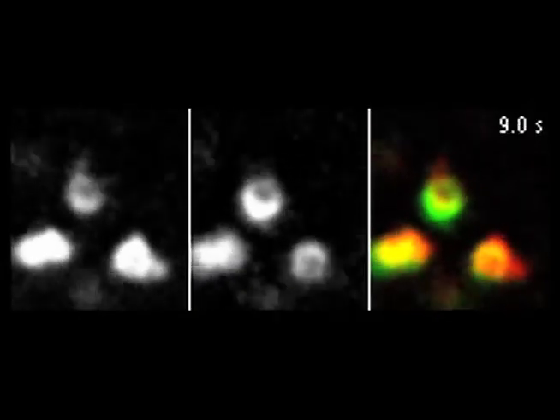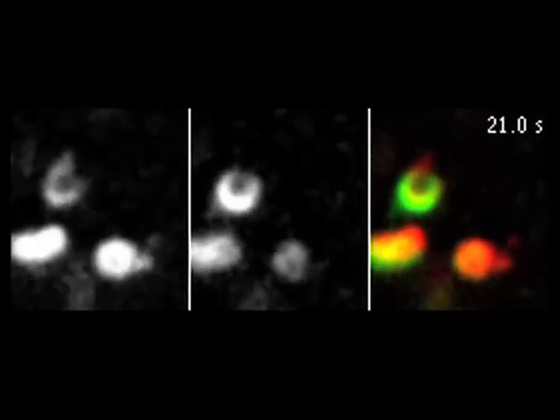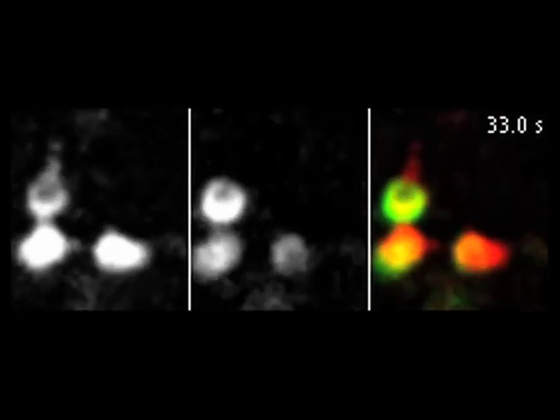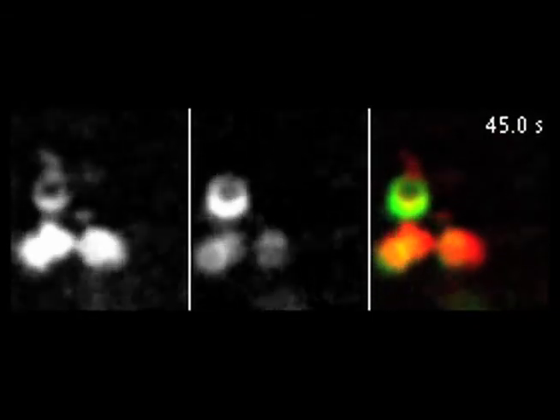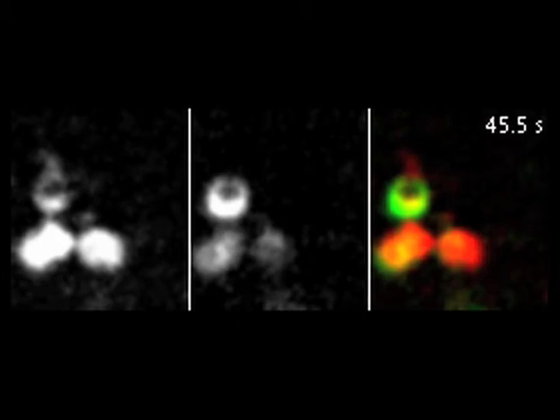Using live cell confocal microscopy, we were able to visualize individual sorting events as they occurred in the endosome. As seen in this example endosome, the recycling beta-2 adrenoreceptor was sorted into endosomal tubules. These tubules are devoid of the non-recycling delta-opioid receptor and eventually pinch off vesicles that deliver receptors back to the cell surface.